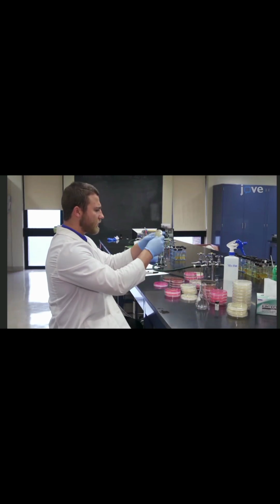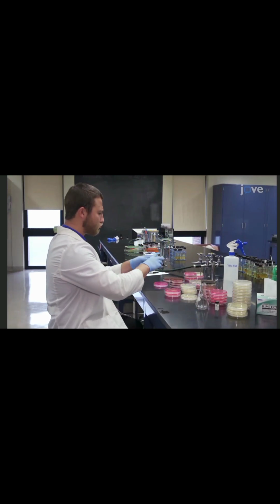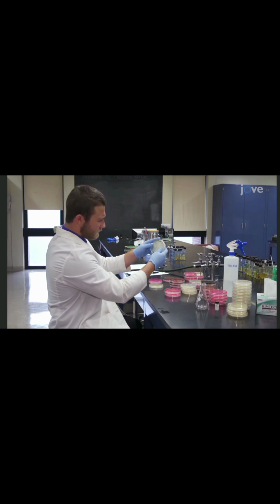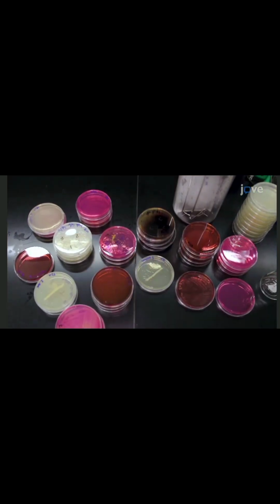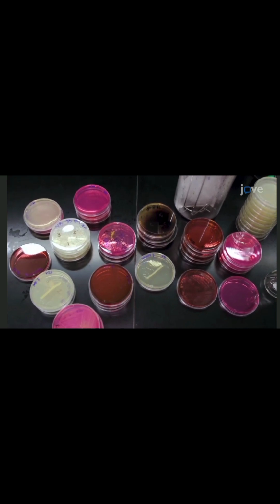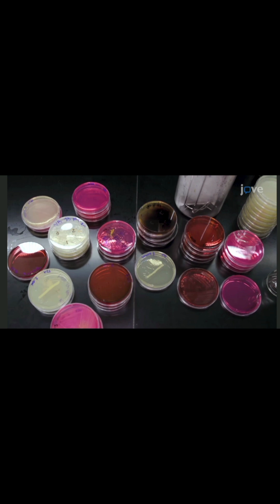Experiments like this, to enrich the growth environment, can help to favor and isolate a specific species from a mixed sample. They can also help determine the optimal growth conditions for different bacterial species in a laboratory setting, thus aiding further research.